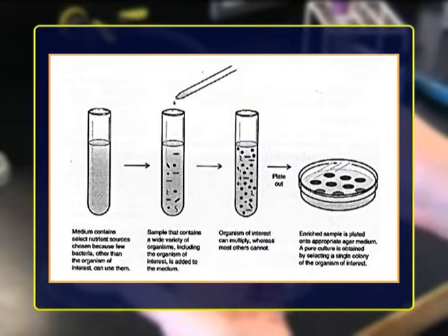The enrichment culture strategy provides a specially designed cultural environment by incorporating a specific nutrient in the medium and by modifying the physical conditions of the incubation. The medium of known composition and specific conditions of incubation favors the growth of desired microorganisms, but is unsuitable for the growth of other types of microorganisms.